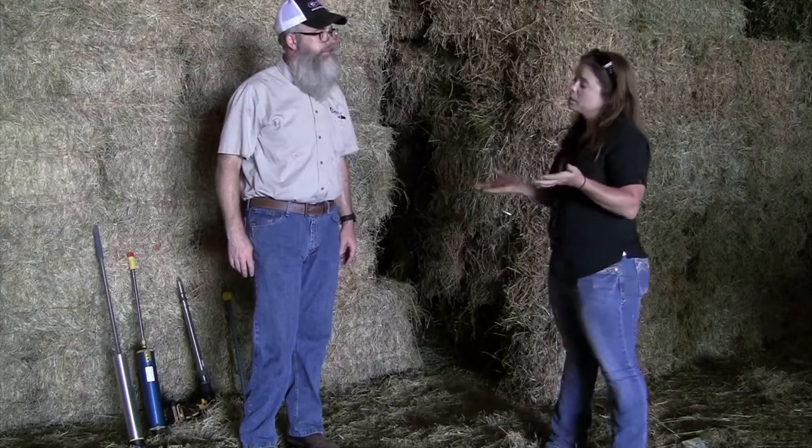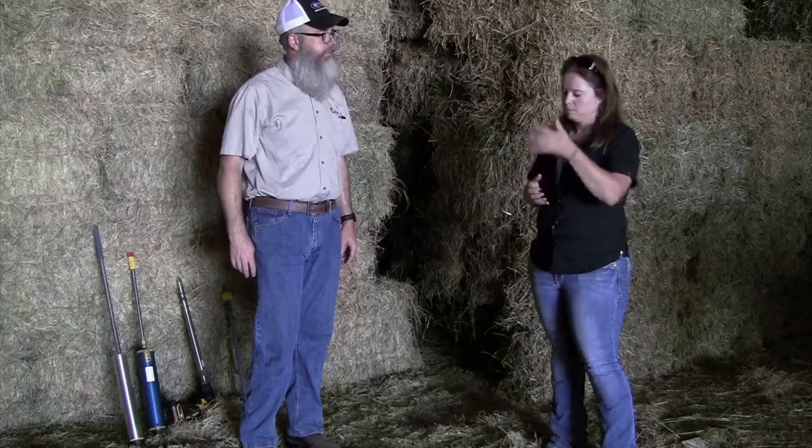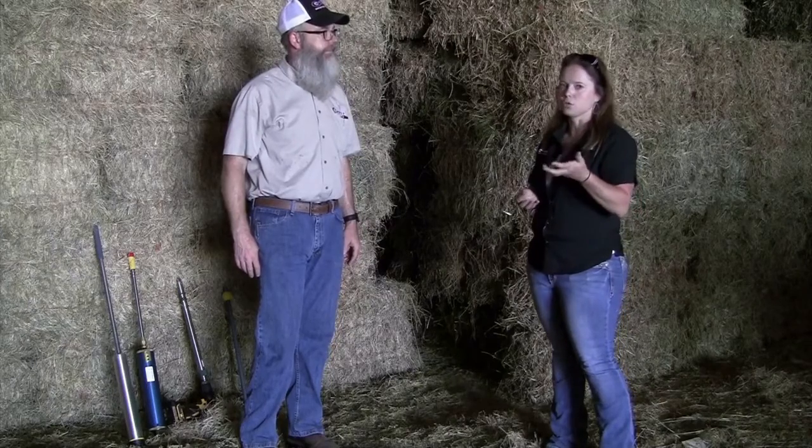And the thing to remember really is that the more representative our sample, or the more different spots in that field in the analysis, the greater our accuracy is going to be. So you're really getting a better idea of what the nutrition is for your horse.